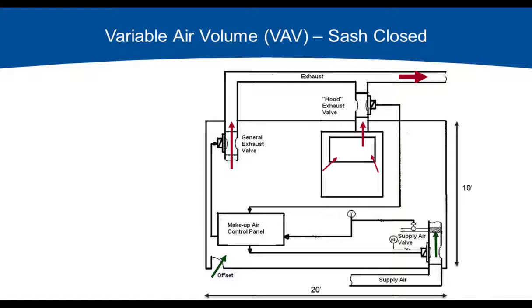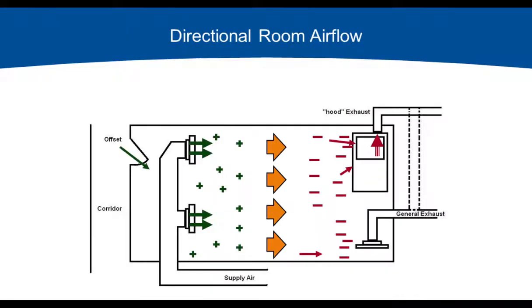Traditionally, you're going to have quite a few fume hoods that are going to be working off this same type of system. So there's going to be a lot of air supply and exhaust air fluctuations, and these dampers modulate how much air is going to be moved through the hood, through a valve, through multiple rooms. So it's much more complex. This is, I want to say dumbing it down, but trying to make it a little bit more understandable on a small scale, even though these systems are traditionally on a much larger scale.